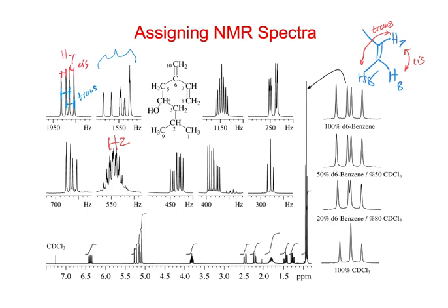I have hard copies of things. And you could just hold this up here, and you could draw a line here and here, the size of this, and then you could just slide it over here, and then notice, it matches those two right there.